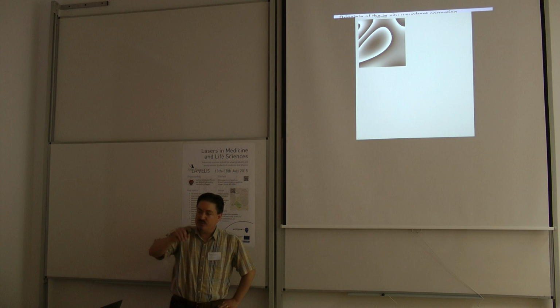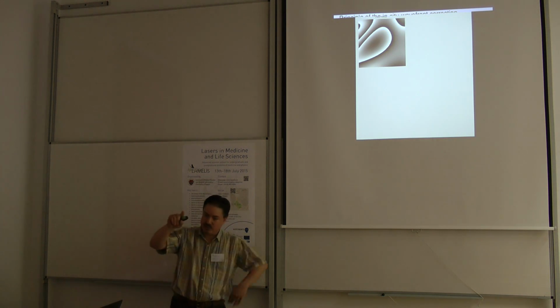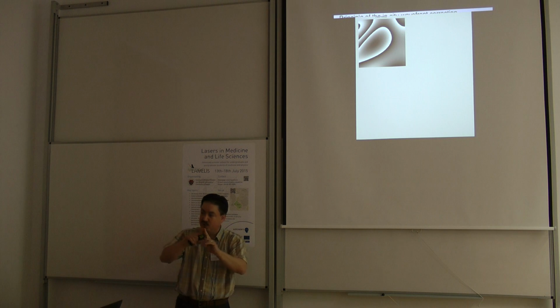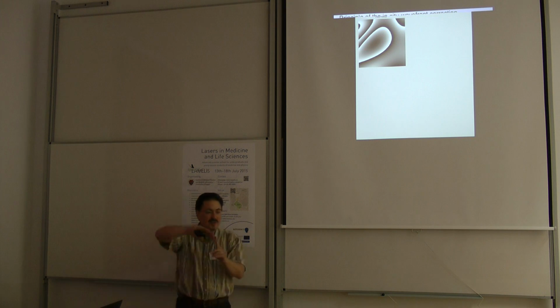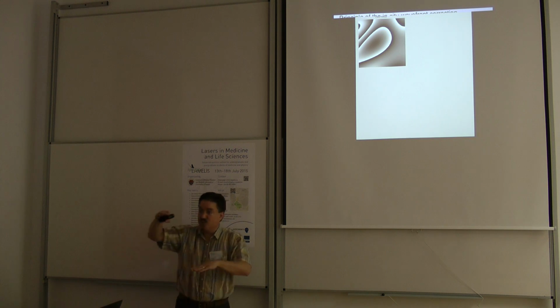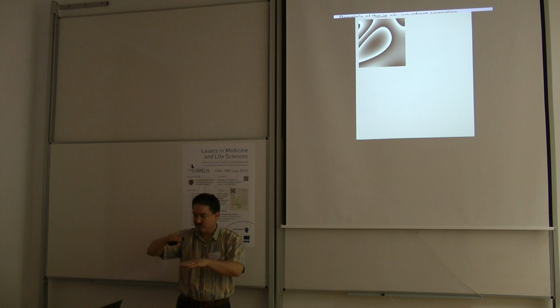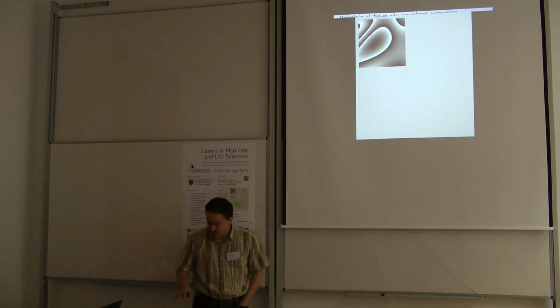Right? And because phase is sort of like on a circle, whenever the phase changes by 2 pi, I basically get the same behavior, right? So every time you see this black to white jump, it's when the phase actually made a 2 pi jump, right? And I don't need to bother with this, so I can just take the modulo of the whole phase on the 2 pi interval, right? So I don't know about any of these.